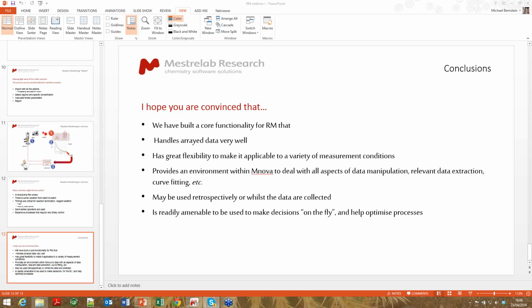And another from Sunil: I use HSQC1 to monitor enzyme kinetics. The data is seen in absolute value rather than phase-sensitive mode and peaks are overlapping. How would you work on this data set? We currently do 1D, yeah. So we don't deal with 2D data, but that's not the question you're asking.